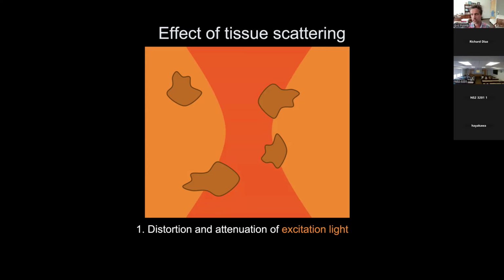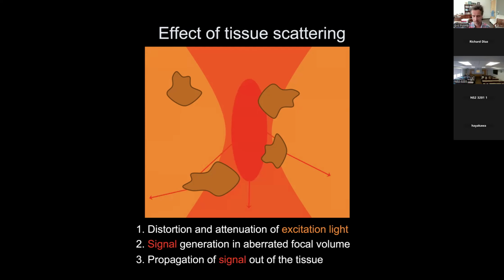But what happens, of course, is that light scattering will try to counteract that. It counteracts this perfect diffraction situation, changes the direction of photons and so forth, and therefore the diffraction that makes this cigar very tight in space becomes not so tight in space anymore. So what happens is the focal volume becomes aberrated.